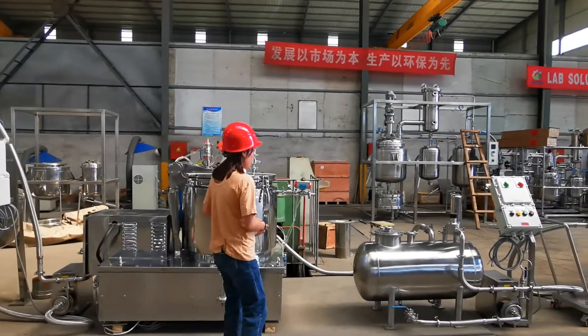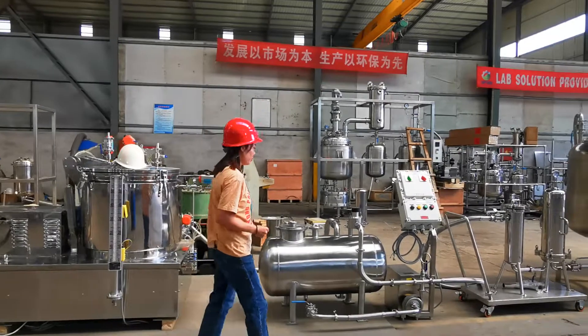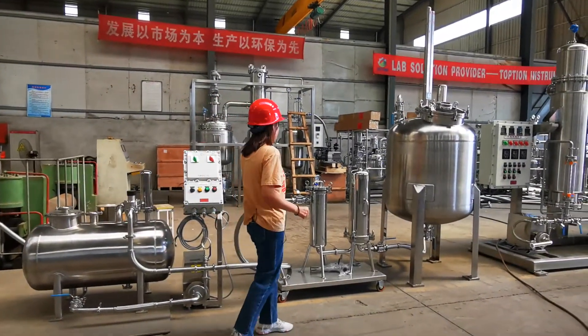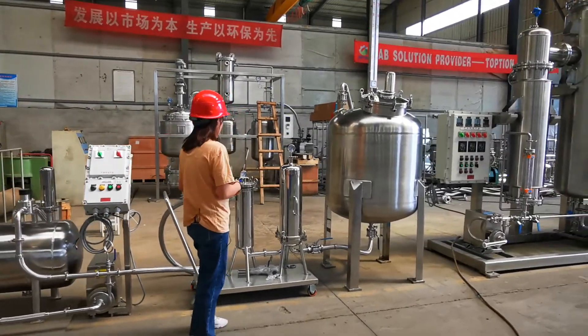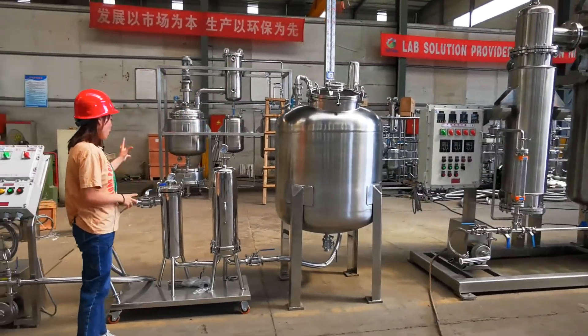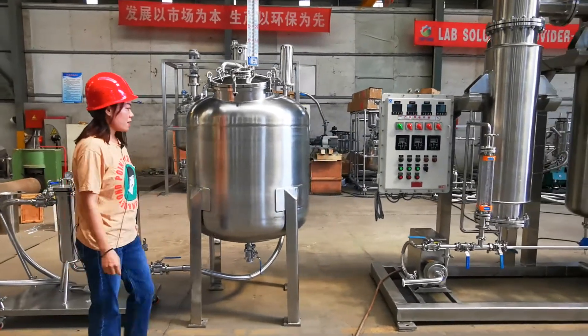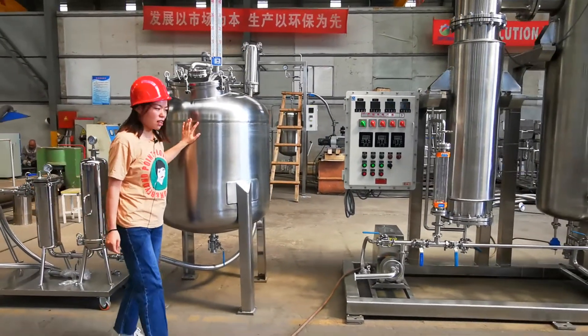because it should connect with a chiller. And this is a storage tank pump to make the material go to the filter. This is the filter, and this is a single-layer storage tank.